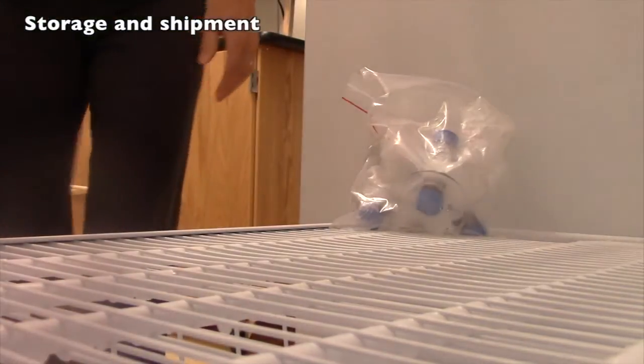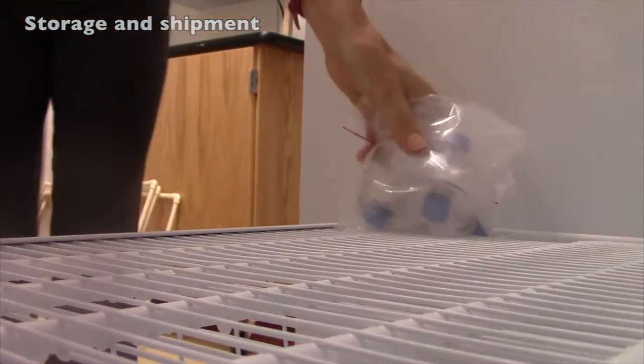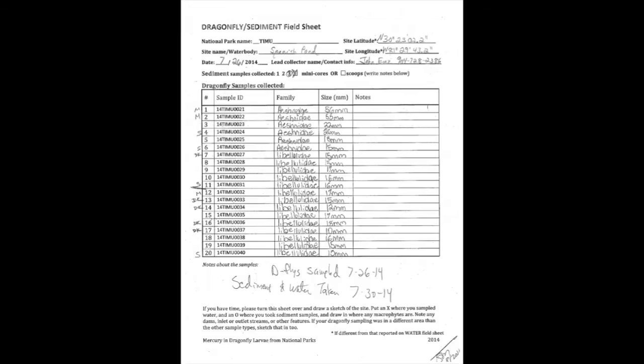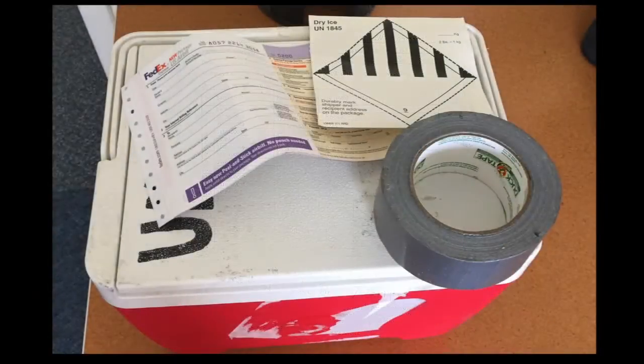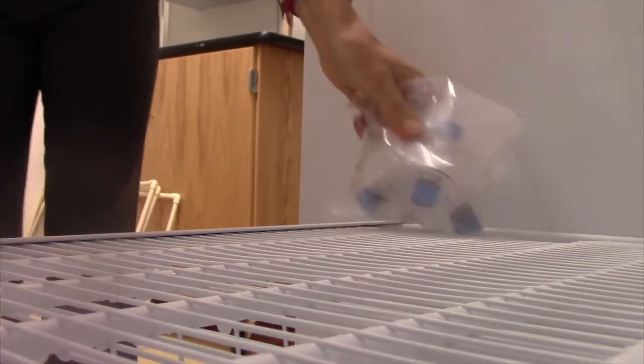No need to rush back to ship immediately after sampling, unlike the water samples. To ship you will need your samples, your field data sheet, a cooler, your FedEx shipping label, the dry ice label, clear packing tape, dry ice, and your field coordinator's contact information. Take your samples from the freezer where they have been stored.